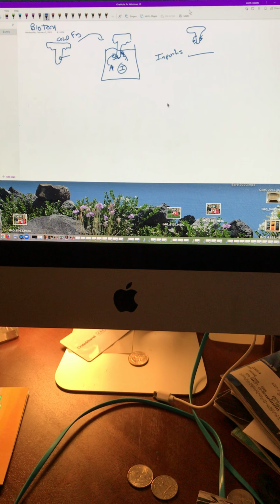It's actually literally called a cold finger. And what happens is, what deposits on the cold finger? Well, what deposits? Impurities or your substance? Yeah, usually impurities. It could be either one. Well, solid, no kidding, Miss Elena, but which one is the solid? Is the solid your impurity or what you're trying to get to? Which way to go?